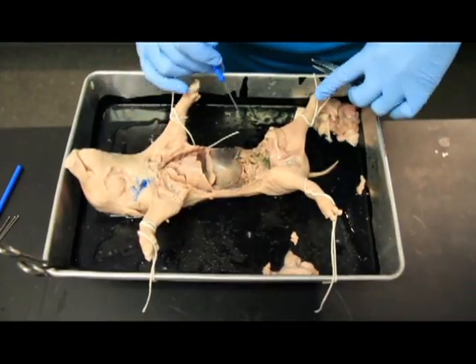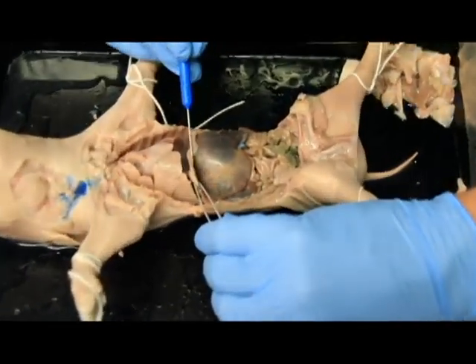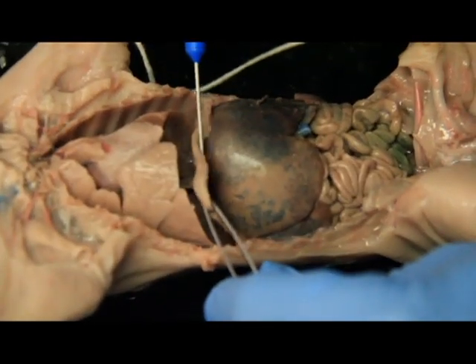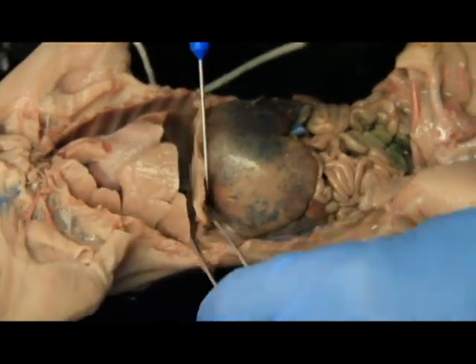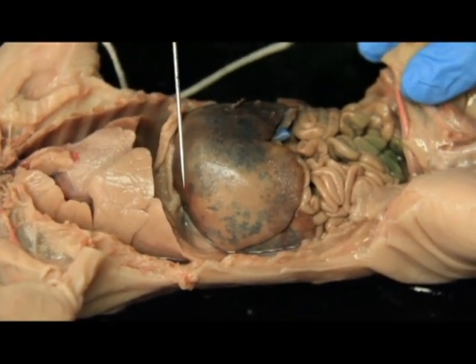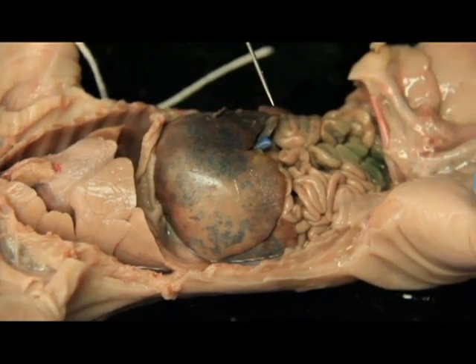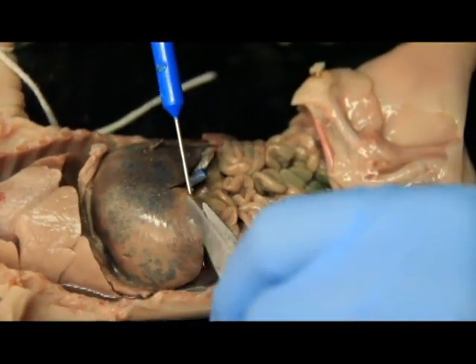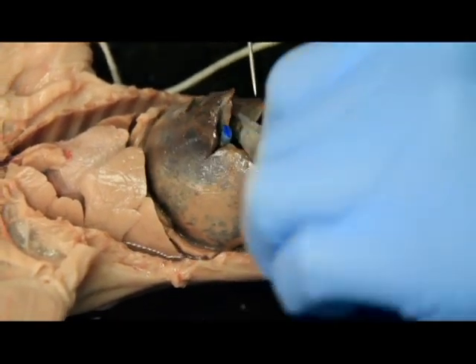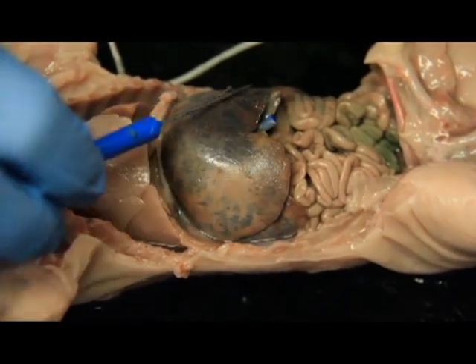Okay, so now we're going to go over some of that central body cavity. Again, remember this membrane that was covering this whole lower body cavity here, that's our diaphragm, and you can see how thick this membrane is. And then the most noticeable thing in here is the liver. Usually it's blue, sometimes it's this brownish color. This whole large part here is the liver. There are actually several different lobes of the liver. All of these lobes that are the same material are all our liver.